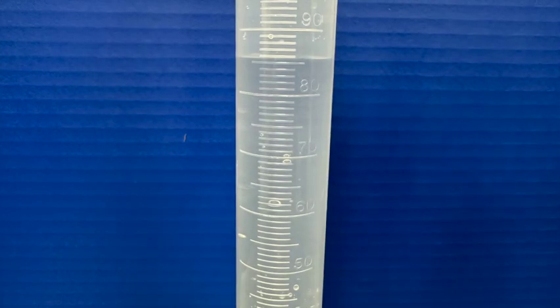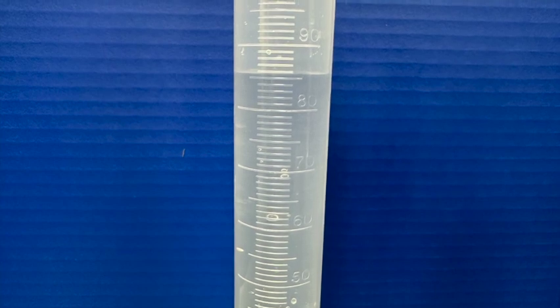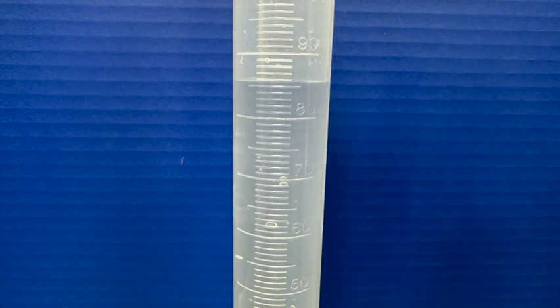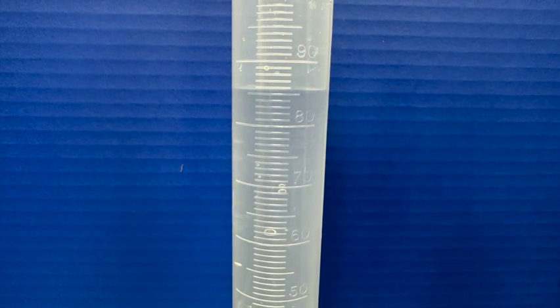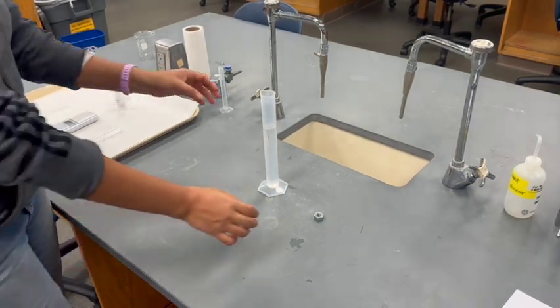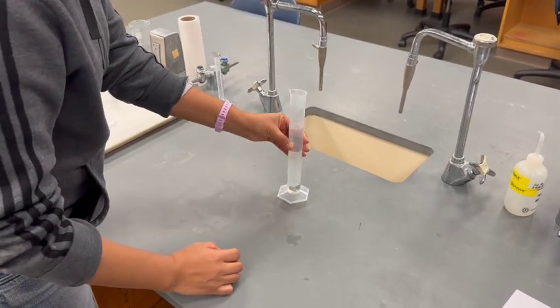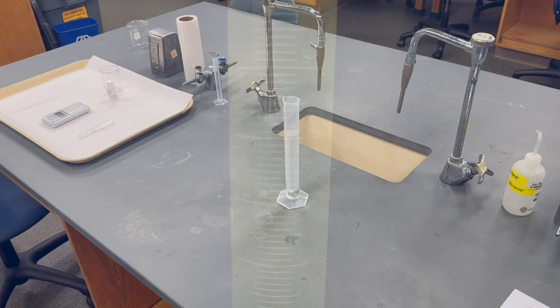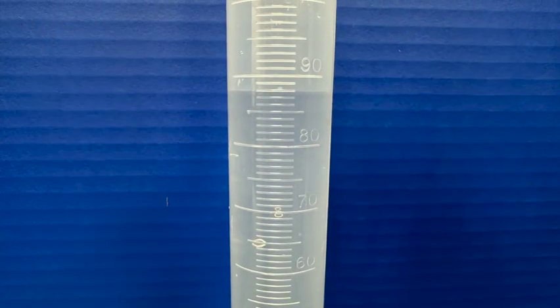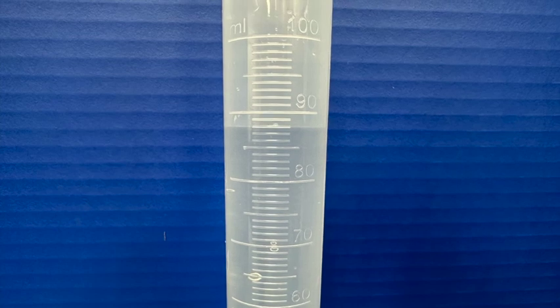To indirectly find the volume of the solid, measure 85 milliliters of tap water in the 100 milliliter graduated cylinder. Make sure to record the volume measurement as described in your procedures. Tilt the graduated cylinder and slowly slide the solid into the water so water does not splash out and give you an inaccurate volume. Record the volume of the solid in water, then calculate the volume of the solid by water displacement.